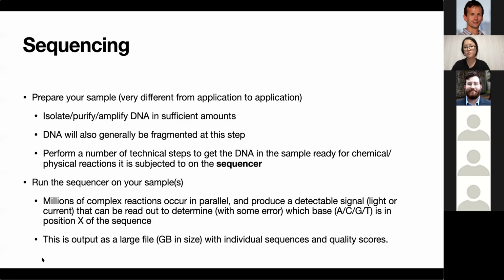It is not my aspiration to give you anything that resembles a comprehensive overview of sequencing. This is just very, very superficial, and I presume that a fair number of you have come across it in some capacity, especially if you're a biology major, because sequencing is one of the most fundamental techniques in modern biology and modern medicine. And roughly speaking, all sequencing approaches consist of two major steps.